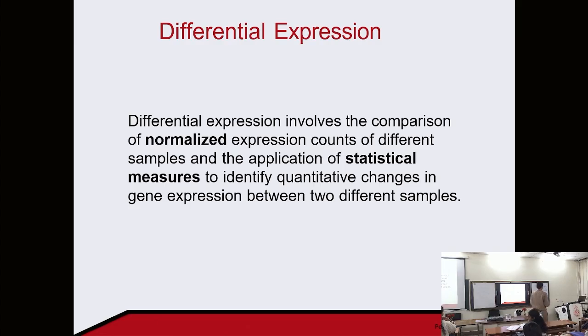On the other hand, for some other gene, I will just reverse it. It could be for some other gene, in the disease condition, it is 100. In the control, it is 1000. Okay. So what will we say? Yeah, tenfold down regulation.